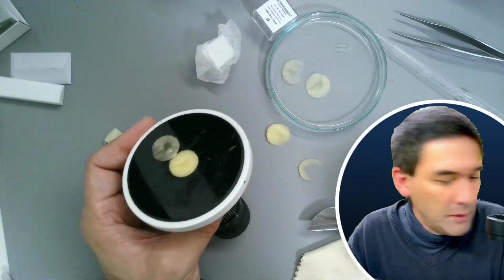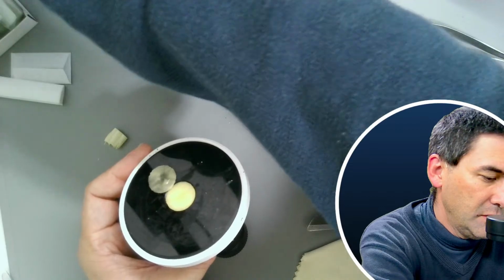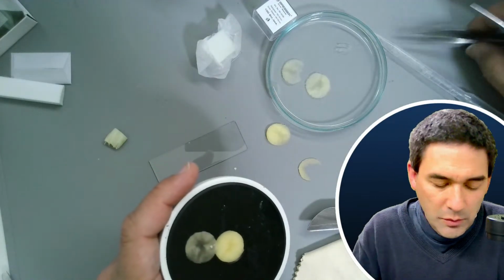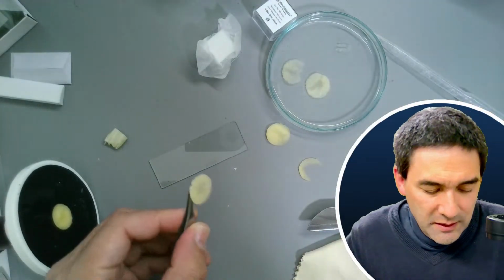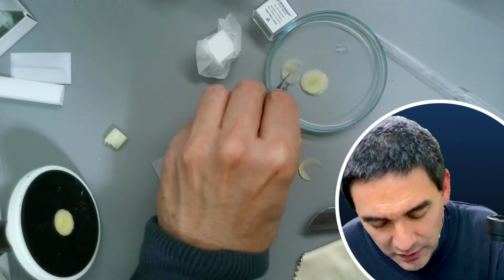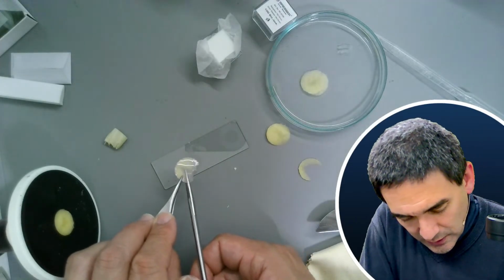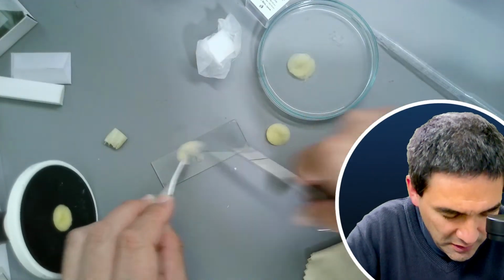So I need some slides. Let's have a look. Where is the next slide? Here we go. And this is way too big, right? So what I'm going to do is I'm going to do it the easy way. And I think it's still a little bit thick, I have to tell you. This one is too thick. I'm just going to use the other one in here, which has a very thin part here. Up, or I can't see where I'm cutting. Okay, so this should be it.